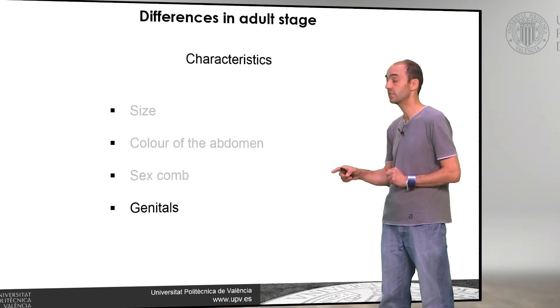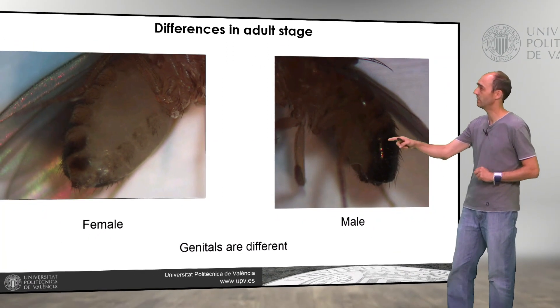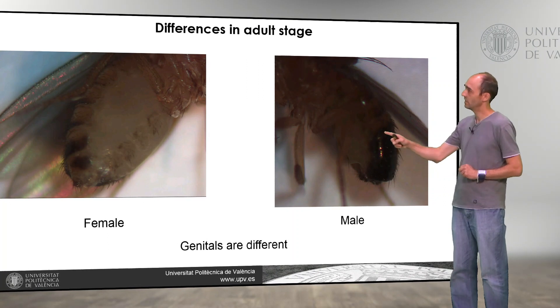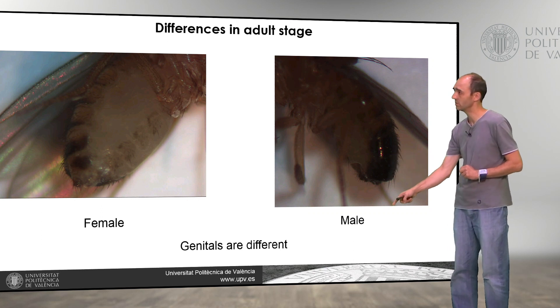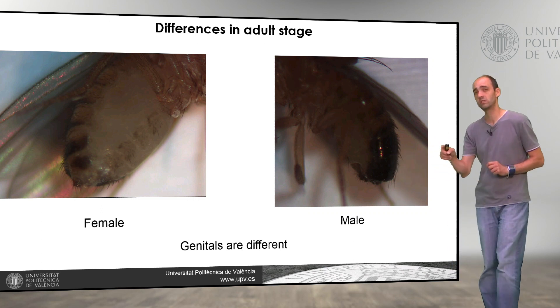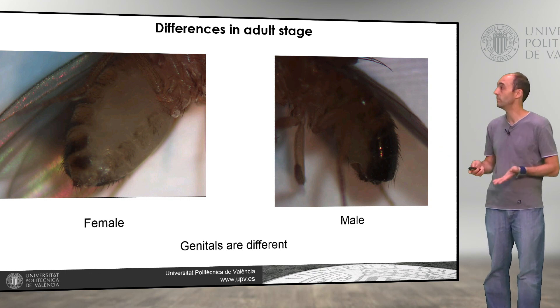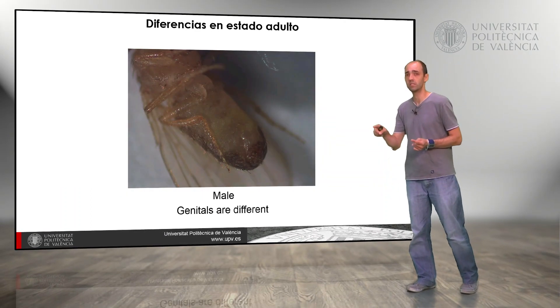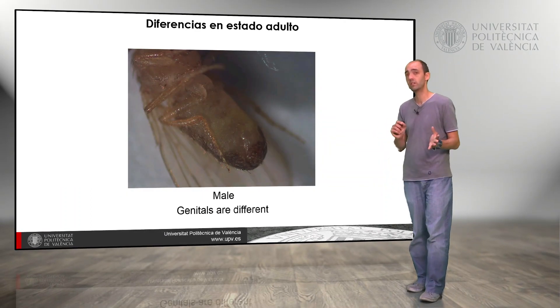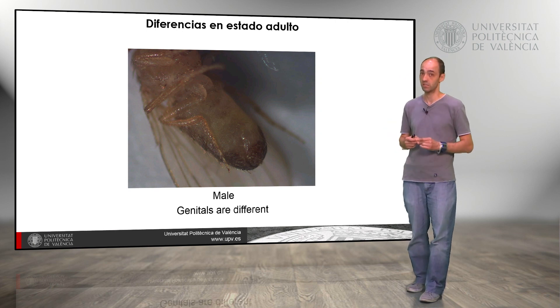The last difference is the genitals. If we look at the abdomen, here we can see a female and here a male. As we saw previously, the color is different, but focusing on the abdomen shape: the end of the abdomen is rounded in the male and pointed in the female. The female's abdomen is flat, while in the male it has a small opening, and inside that opening we have the penis. We can use that difference to identify a male or a female.